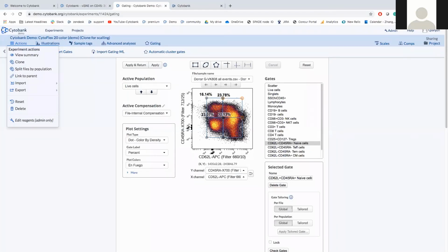Another question in regard to graphic display. Can you have a black screen with white color text graph? Yes, that's possible. You can do it in the illustration.